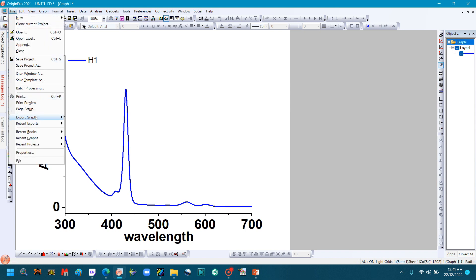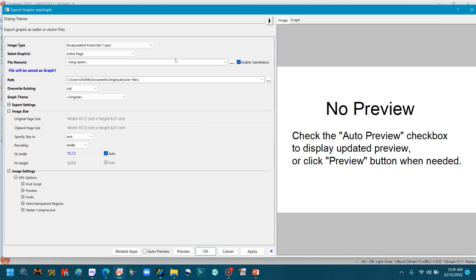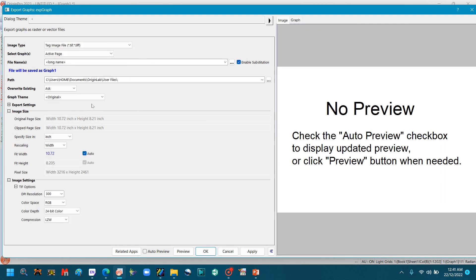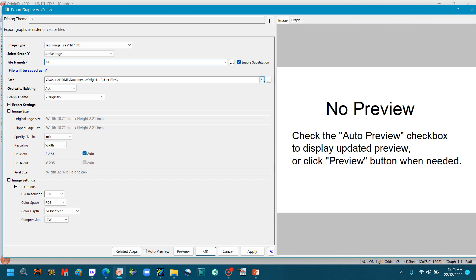Then you can make the TIFF file. Go to File, Export Graph, open the dialog, change its image type to Tag Image TIFF. You can also change the name of the graph.